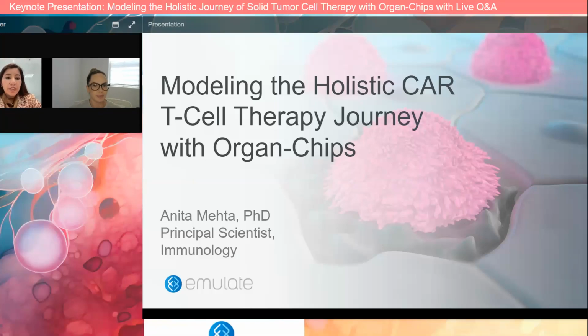Yeah, that's a great question. So this is a highly adaptable workflow, and you can model both types of immune components, including the tissue resident. We have done that in the past on the liver model, where we used Kupffer cells, which are the tissue resident macrophages. You could also do the circulating immune cells, which we also launched the immune cell recruitment application some time ago that uses an IBD model, and then the CAR T is also where you can use the circulating immune cells.